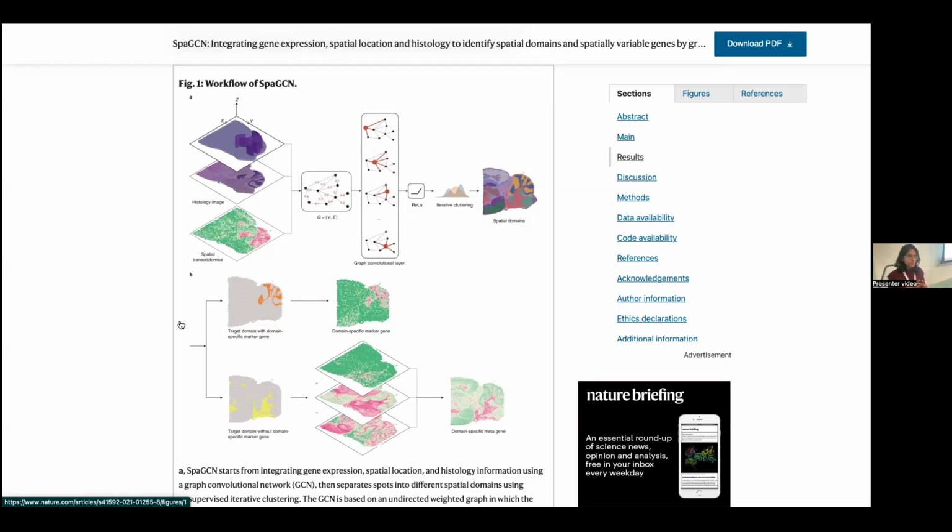Which means that a disorganized cell type structure by gene expression will give you a uniform RGB patch. It is something that we fail to remember, but we can use it, because we see it often, especially in H&E. Why is it that there are so many papers that successfully interpret gene expression from H&E? Because there is that connection between order and disorder. So that's the principle of it.